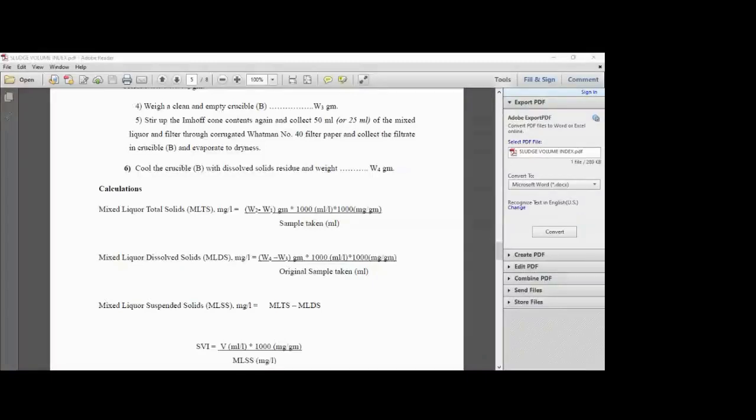If the volume of the sludge that is getting settled is huge, that means the process happening is good. So in the supernatant you will see clear water, right? But if you see a lot of turbidity in the supernatant, then you can tell that the process is not happening properly, and you can put a complete inquiry on that particular plant with the help of registered laboratories, and then you can check whether they are following the entire processes properly or not.